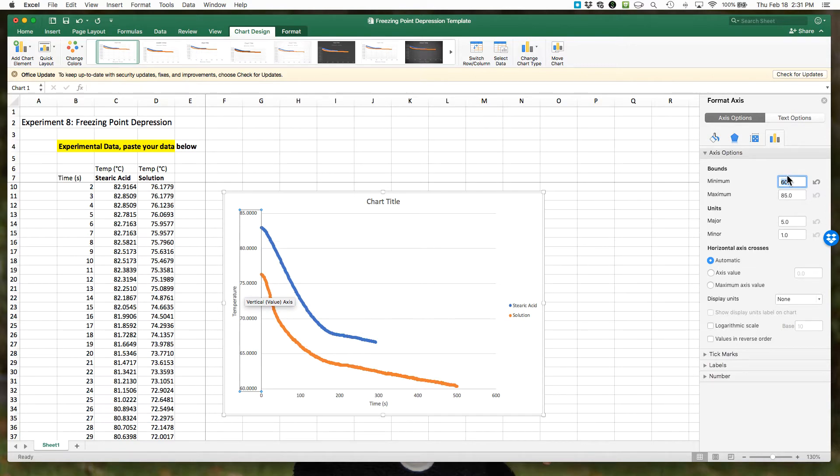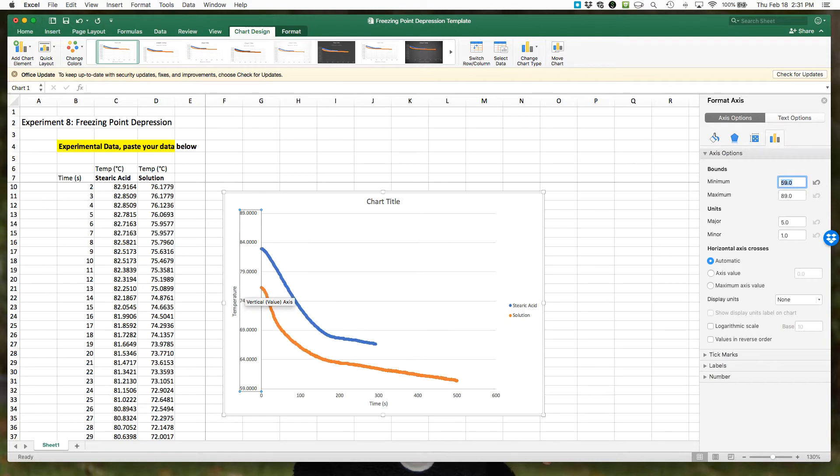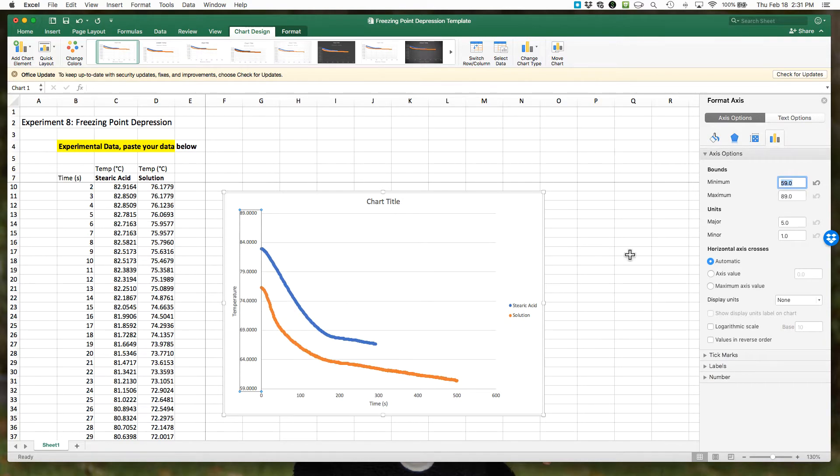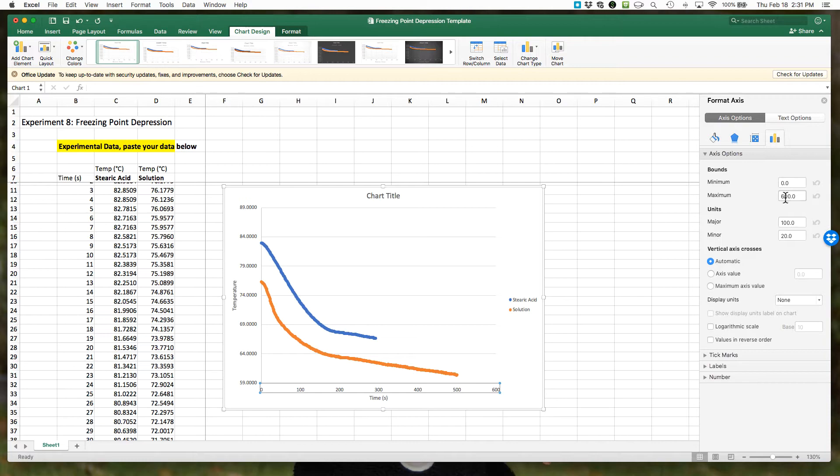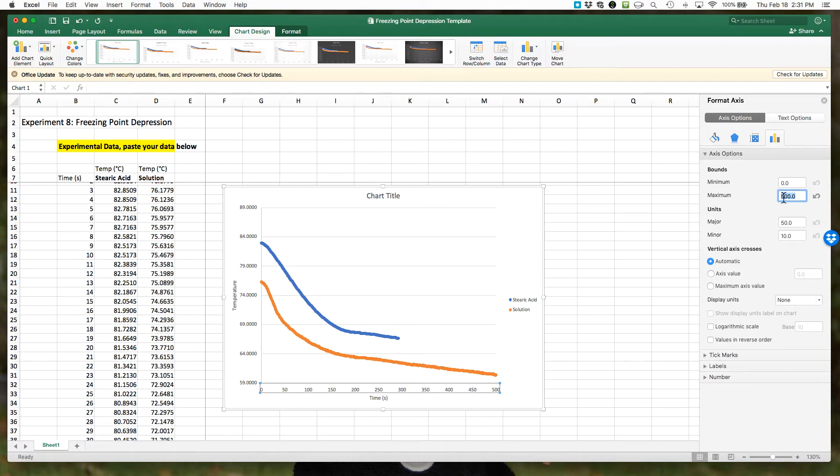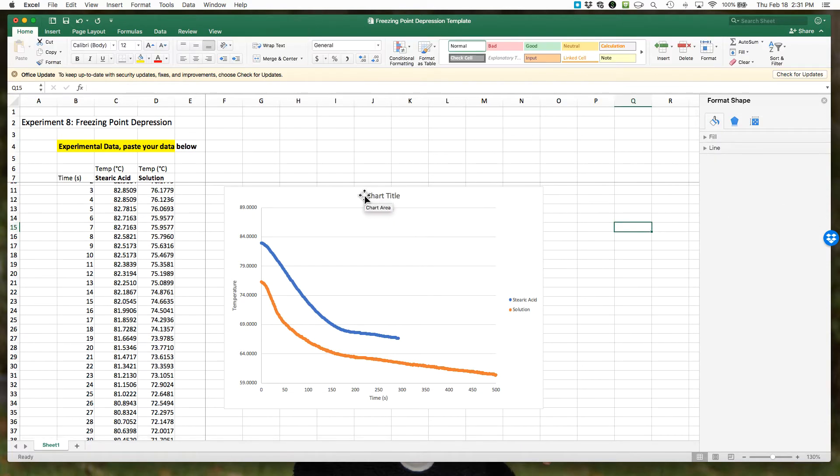On the x-axis I'm going to do the same thing. We don't need to go to 600 seconds since our data stops at 500. I'll change the maximum to 500 seconds. Here's our data and our plot. You should give yourself a descriptive title, I'll leave that to you.